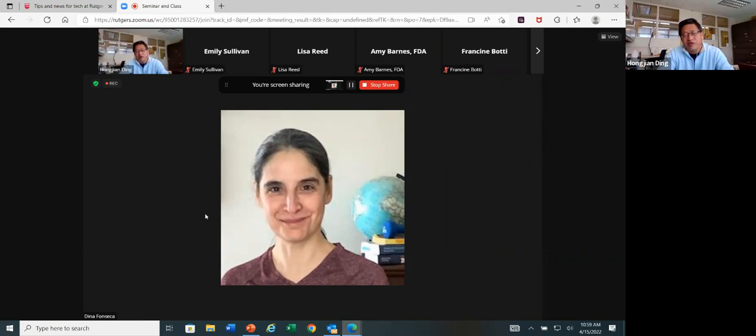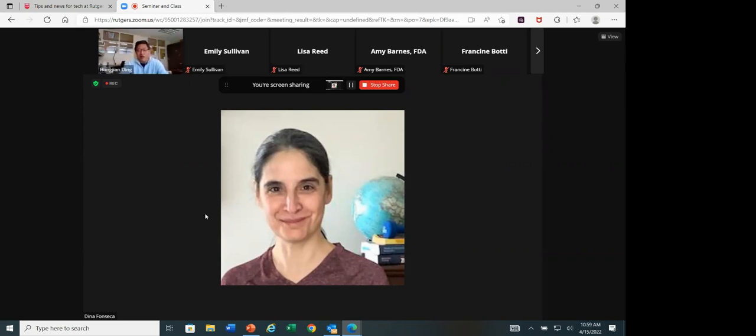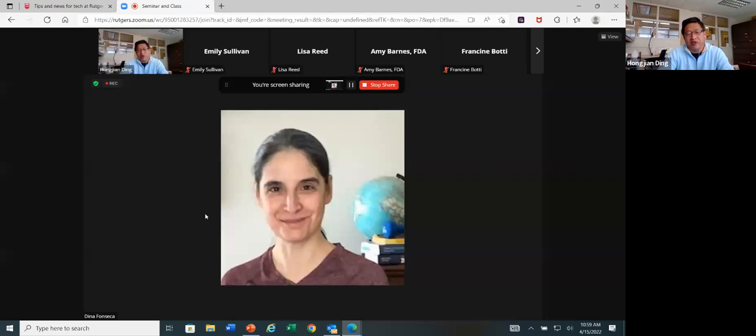We have not addressed that yet because it's not common food so far. I guess if the food comes in, we'll ask, okay, what kind of species is there? Except for this species, other species are supposed not to be there. Then if they are there, that's filth elements.